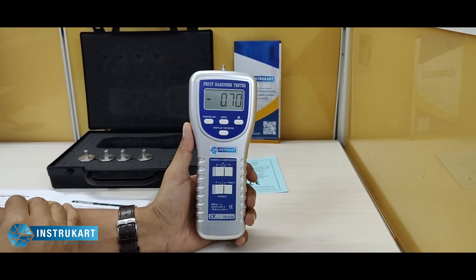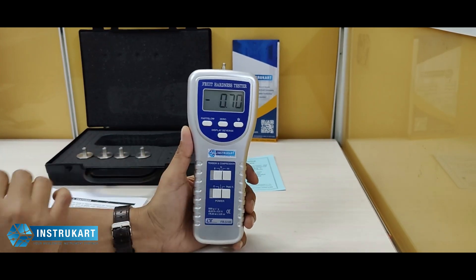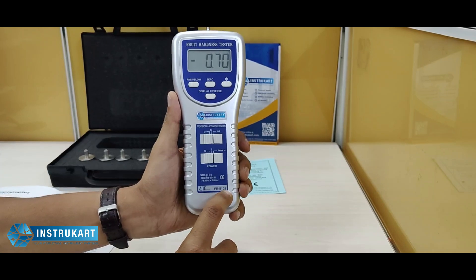Hello and welcome to InstroCart Holdings, your worldwide instrument partner. We have got a fruit hardness tester offered from Lutron. The model number is FR5105.